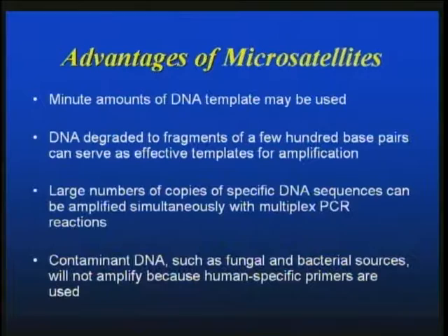Additional advantages is that you need very little amounts of DNA. And this is a huge advantage when you're looking at cell subsets because oftentimes you can get few nanograms of DNA out of an isolated cell subset. And that allows us to still question what a percent of donor in a mix would be. The DNA can be degraded, it doesn't have to be intact. It can be only a few hundred nucleotides in length and will still be an effective template.